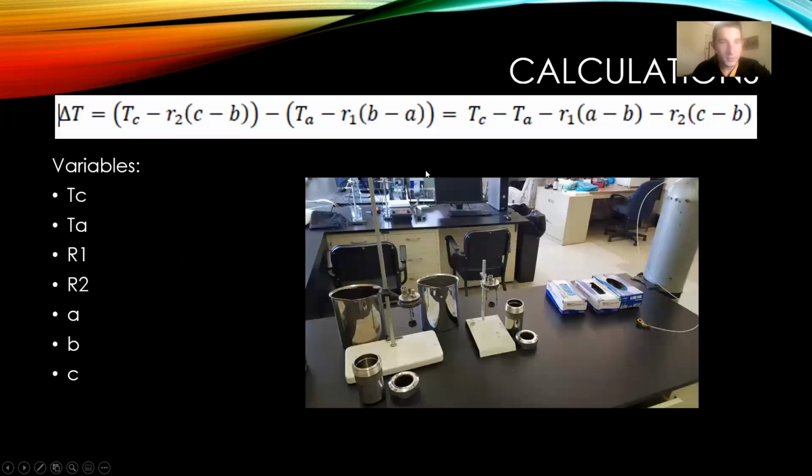Okay. So here's the most important equation, I would say, that these graphs help solve for. The graphs from the previous slide help solve for this equation for the temperature change in the bomb calorimeter. This is what that equation is. And basically, we're most concerned with the second half here, which is equal to the change in temperature, delta T. So let's see some of these variables here.